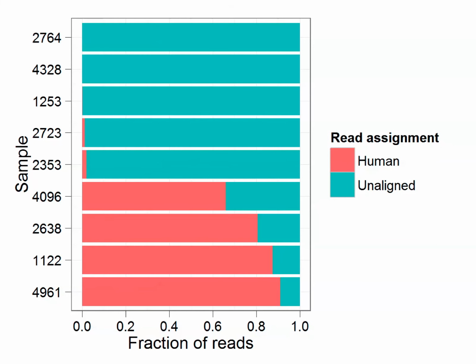Now we got some strange results. So the first thing Nick did was to actually align the reads against the human genome, because we weren't interested in the human genome, and in fact we were positively disinterested in it. We wanted to get rid of it for ethical reasons. You don't want to release into the public domain, to public databases, human-related DNA sequences.